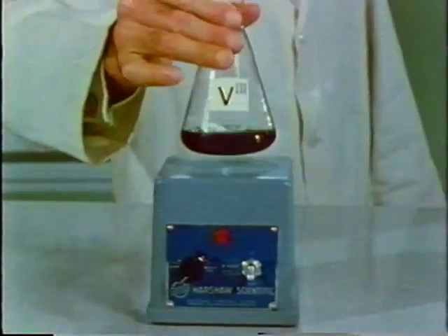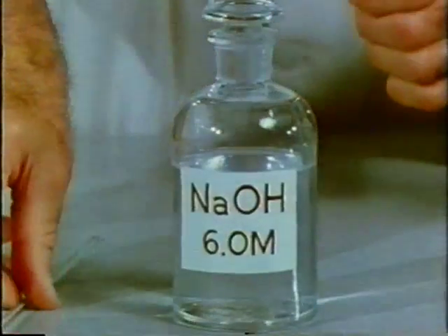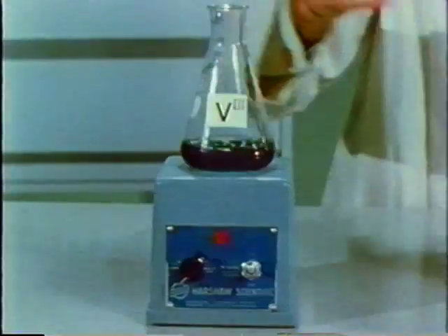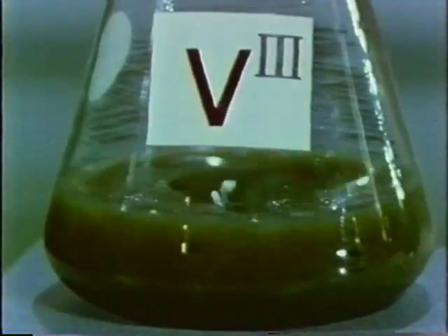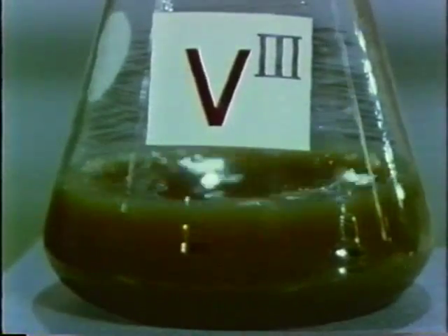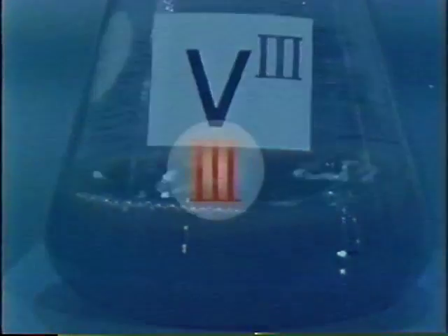We place some green vanadium-3 solution on a magnetic stirrer. Sodium hydroxide is added to the vanadium solution. The precipitate that is forming is the hydroxide of vanadium-3. The magnetic stirrer disperses this as fine particles of suspended material and gives a muddy appearance to the mixture. But what is happening on the molecular level?